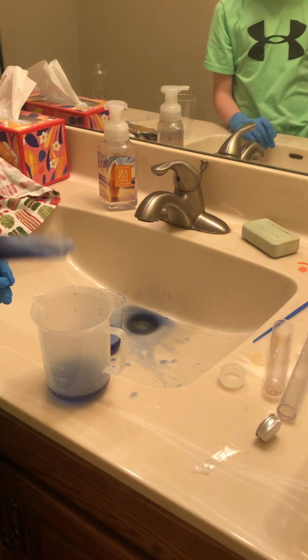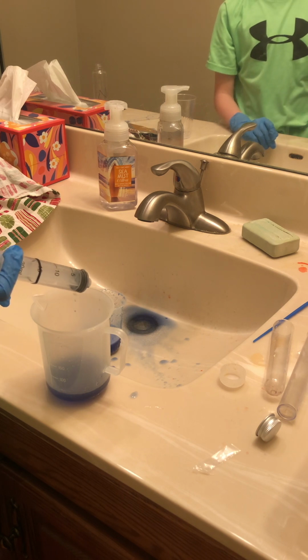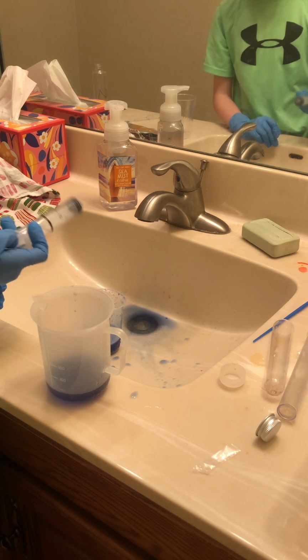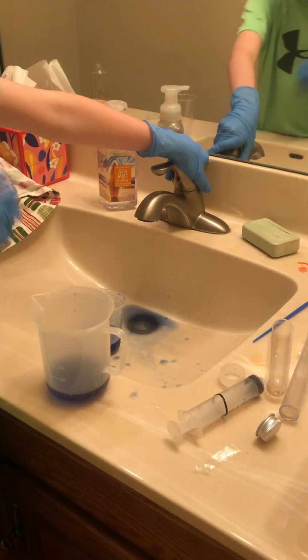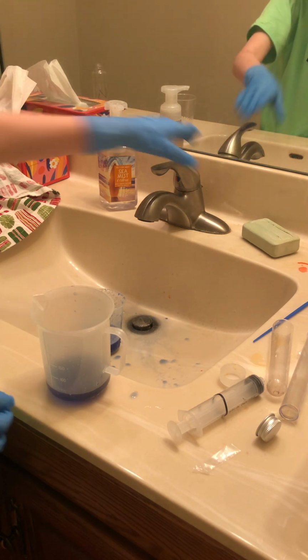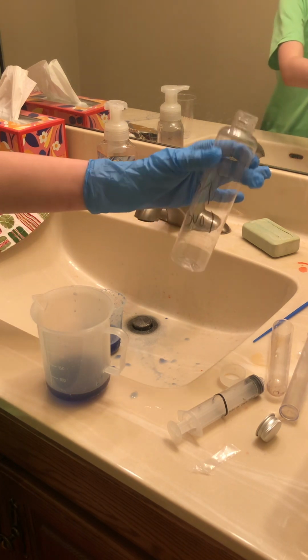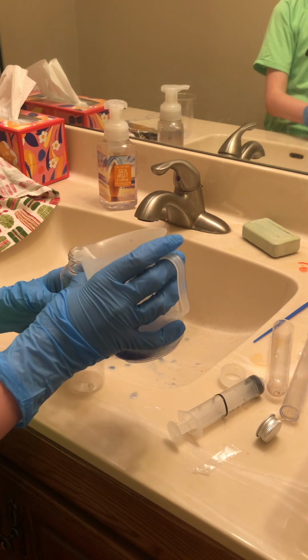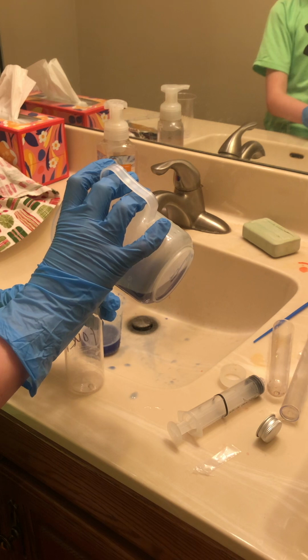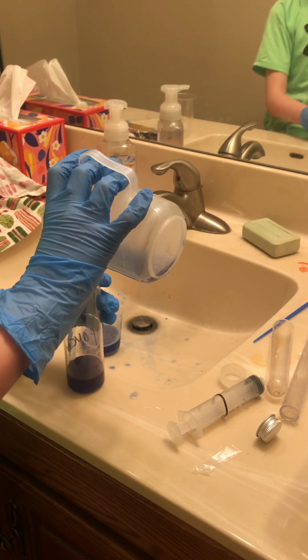Oh, that is a reaction going on. We're gonna open that. That's gonna be doing that. Take this then, your cup. You're just gonna pour in everything. You can just straight go from the pipette to that. I just find it easier to put it first into a beaker.